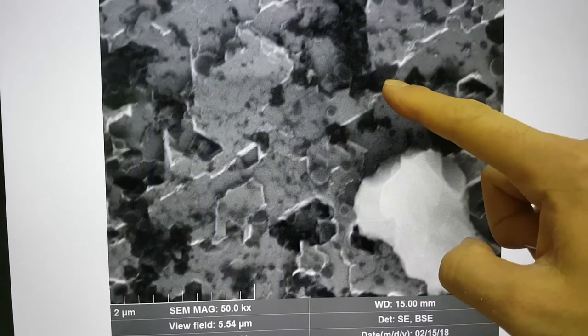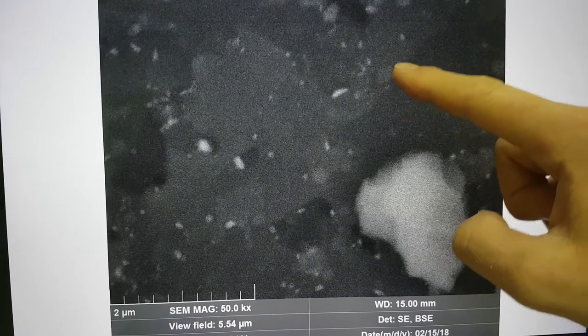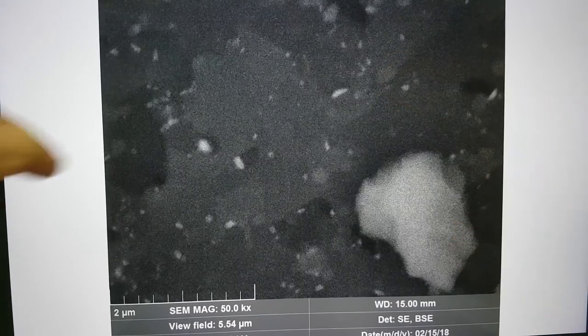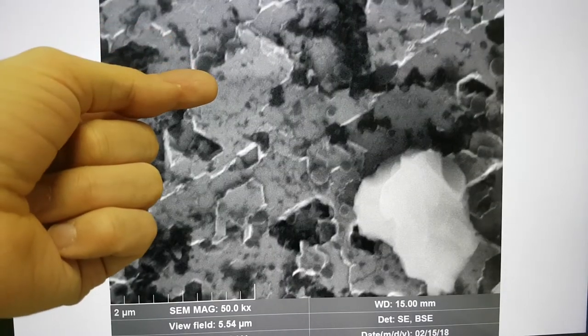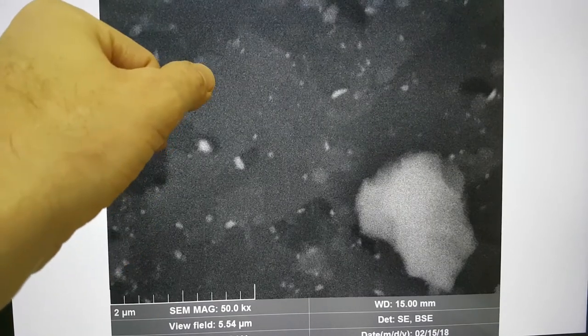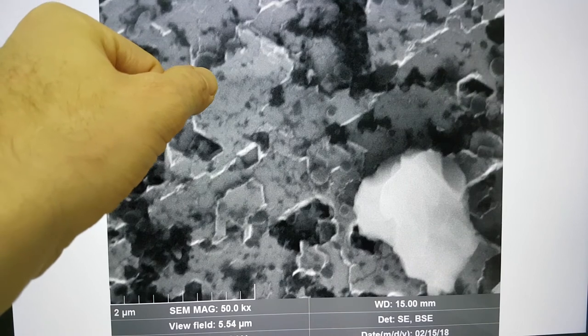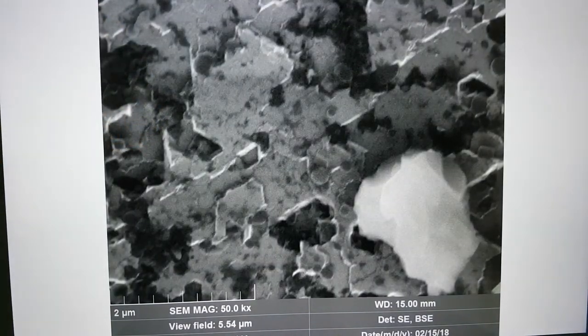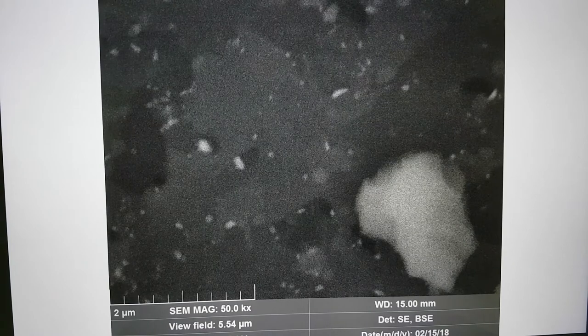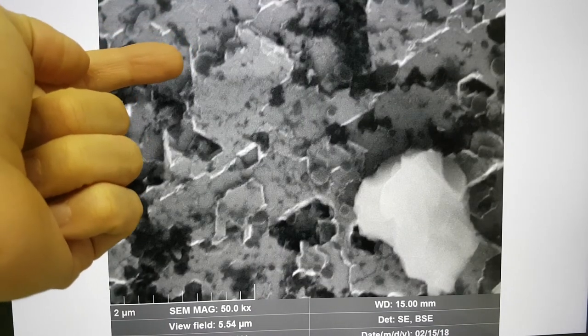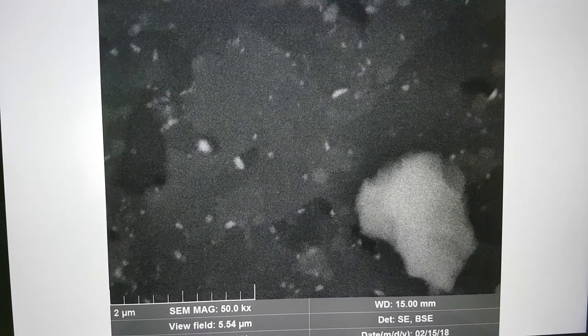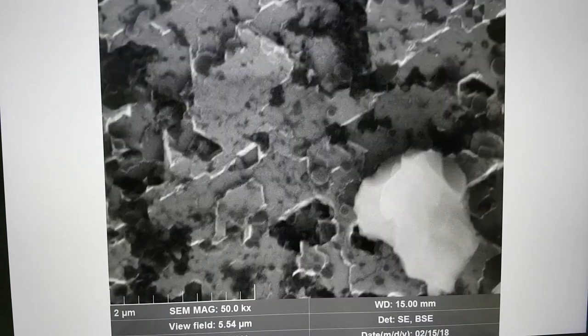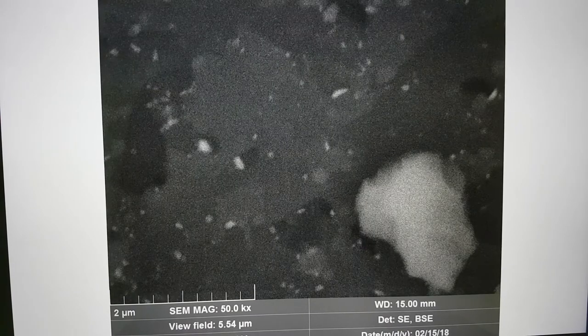What is interesting is these spheres here, in many cases like this sphere here, you can almost not notice them, which means they may still have a very high concentration of carbon. In some cases, like this sphere here, when it goes to the backscatter, you can barely see it at all. This would imply that if that is carbon, it's turning into a sphere. This requires an extremely high temperature because you would need it to turn into a liquid and then surface tension to encourage it to go into a ball.